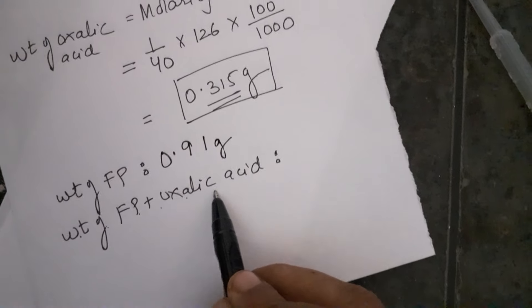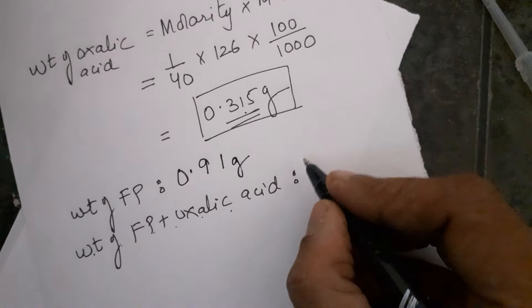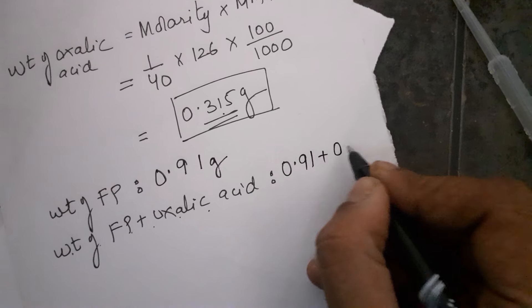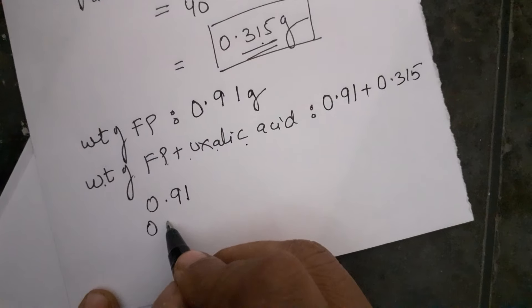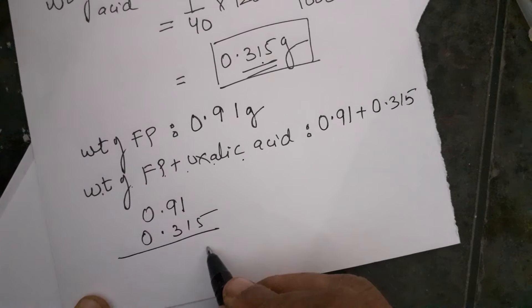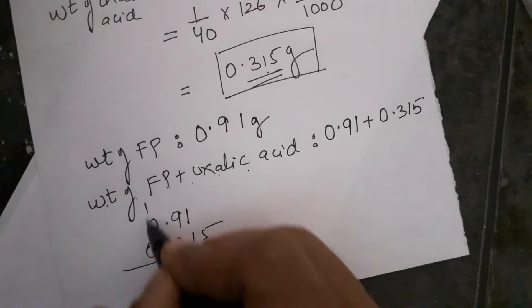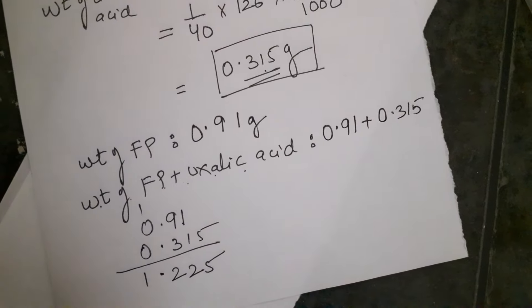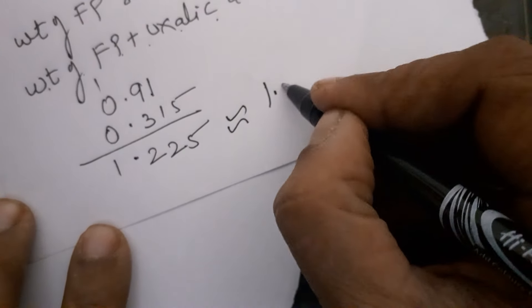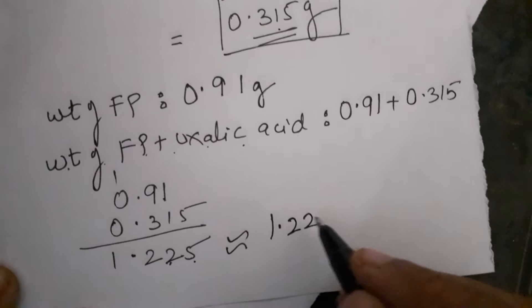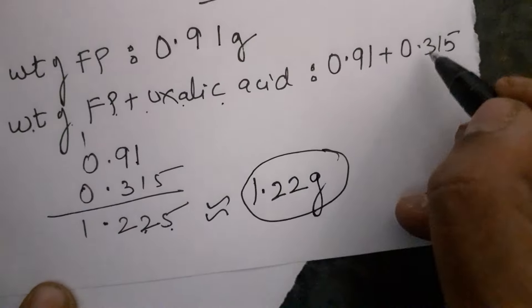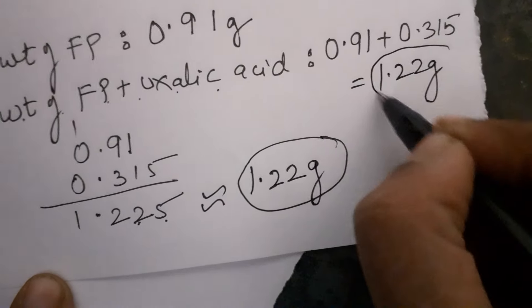Now we need the weight of filter paper plus oxalic acid. We require 0.91 plus 0.315. Adding these: the result is 1.225, but the digital balance only has 2 decimal places and we have 3 decimal places here. So I will round it off to 1.22 — because the digit is even and the next digit is 5, so in the case of even rounding it stays as is. So we need to weigh 1.22 grams here. You will add oxalic acid until you reach 1.22.